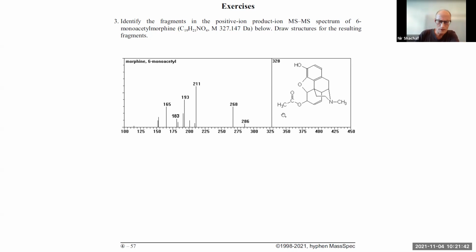So that's good. So we are left basically with whatever the structure is called, with the nitrogen, and then 211 is the loss of the nitrogen containing ring. Basically from 268, C3H7N is lost. That's a loss of 57.